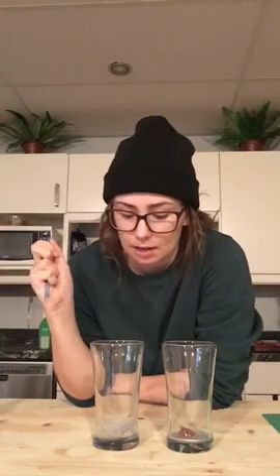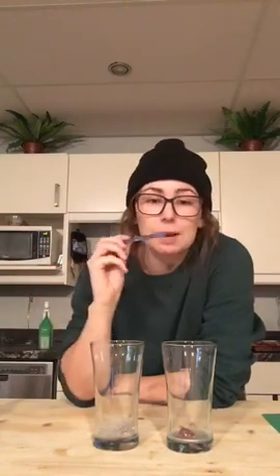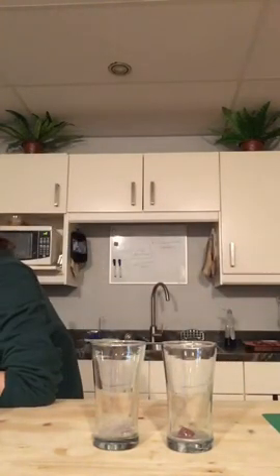So the liquid in this, since the liver has enzymes, actually broke down the hydrogen peroxide into oxygen and water. So oxygen is obviously the bubbles in the foam, and then there's water in the bottom. So that's when I poured water into this fresh enzyme. That's why it didn't react very much, because it's mainly just water. So I'm giving that reaction a 1.